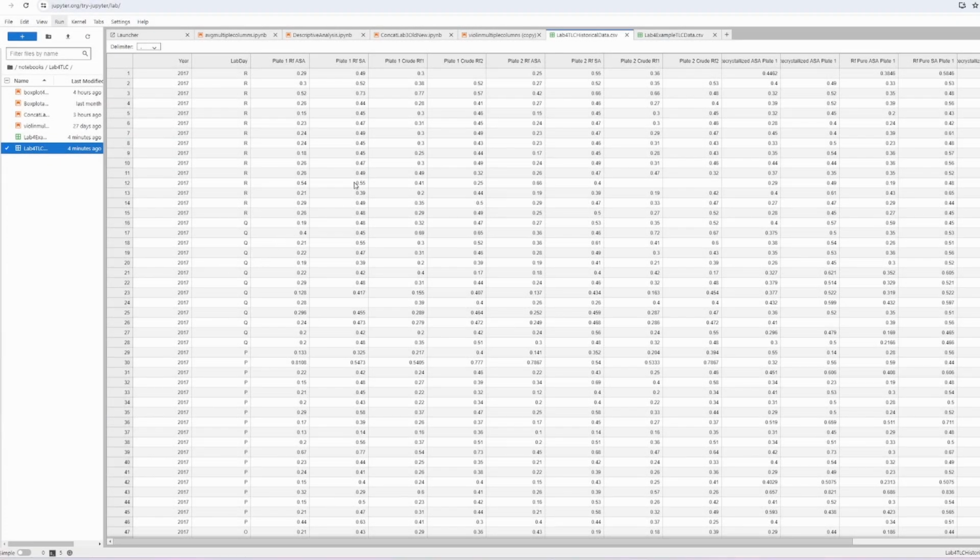So we have another set of data. This is thin layer chromatography data. It's not similar to the melting point. However, we're going to do a couple of things that are similar to the melting point data that we had previously in the last video.